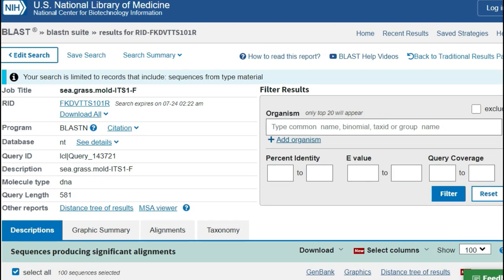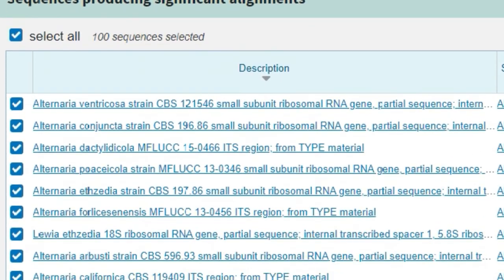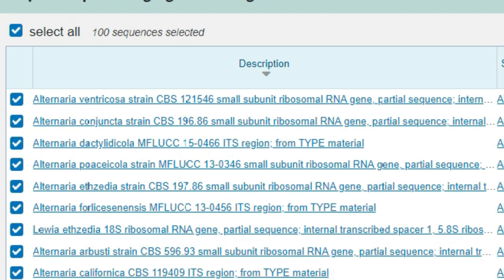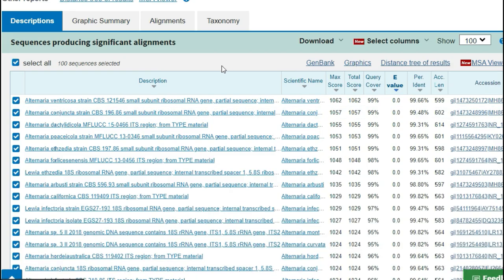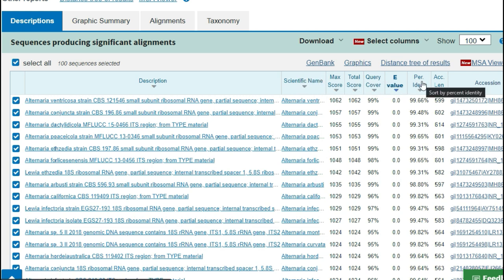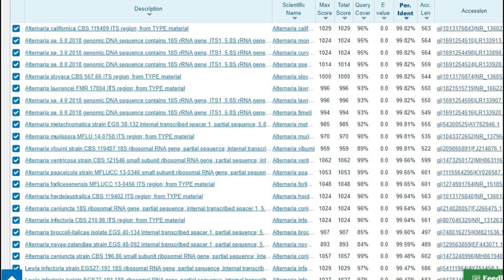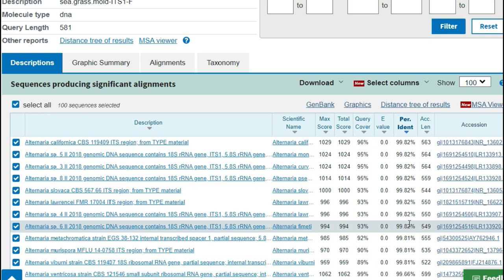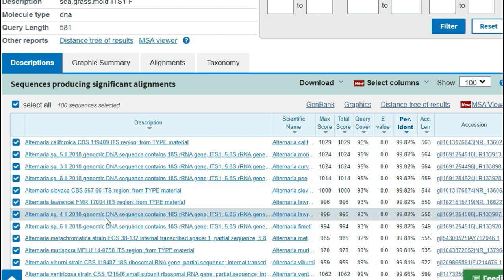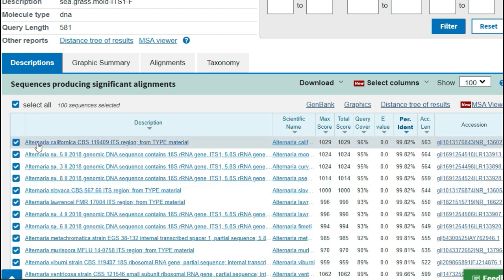And now we have the results and look at that it looks like our sequence matches closely to alternaria species. So we know that our seagrass fungi is some form of alternaria. Now we can sort by a lot of different fields but i like to sort by this percent identical and we'll see that with type species the number one match is 99.82 percent similar to our sequence and that's for alternaria californica.